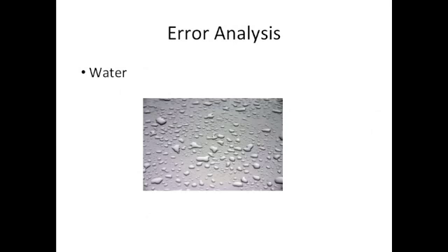The object was placed in a graduated cylinder full of water to measure its volume through water displacement. Although it was dried off before it was weighed, it is possible that water could have clung to it and caused its mass to appear higher. In turn, this would have increased the calculated density, which could mean that it is actually an entirely different substance.